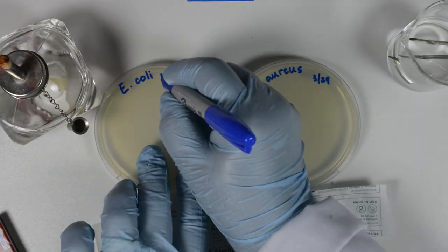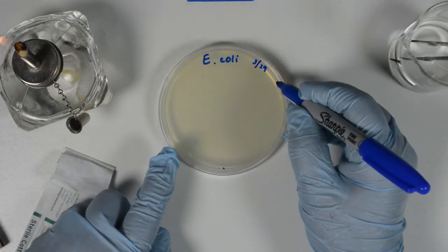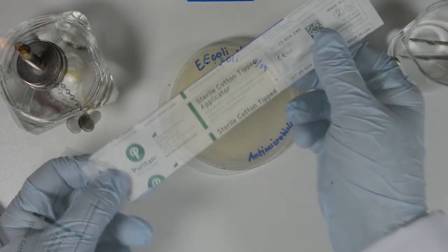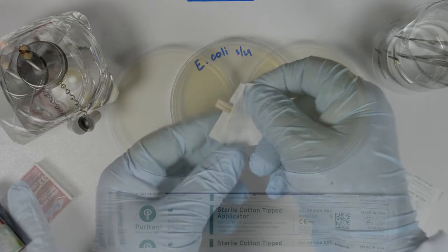Before you start, label the plates and make three marks on the plate at 6, 2, and 10 o'clock to allow you to rotate the plate and cover it evenly. Open the end of the sterile cotton swab pouch to allow easy access to the swab handle when you need it.